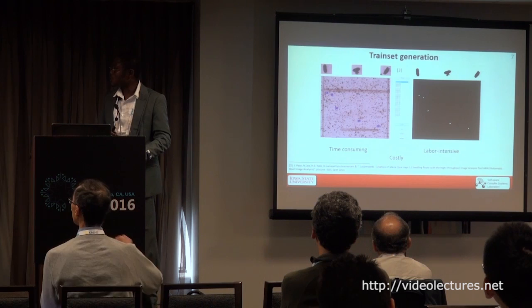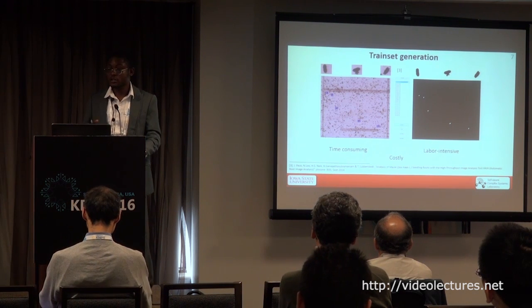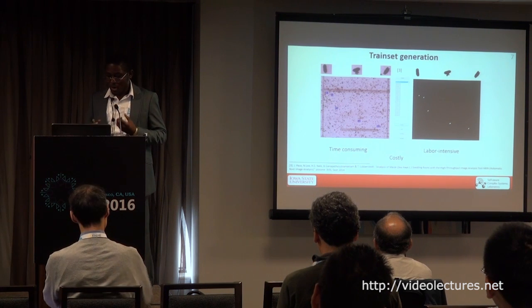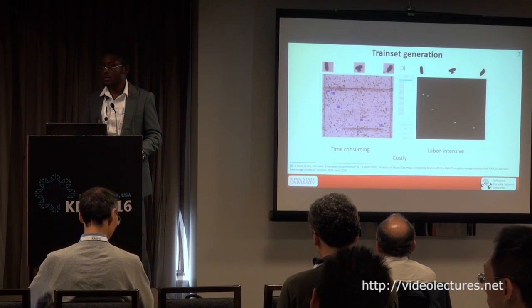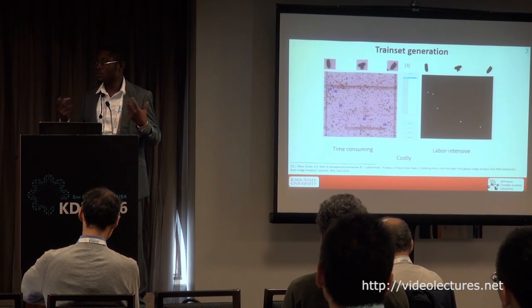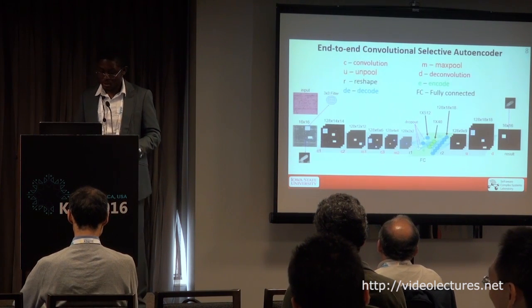On the other hand, some other engineers designed a semi-automated approach where they would do a background-foreground separation, and then use a click style to separate the foreground, which are the eggs, from the background, other debris and other things. However, that's still costly and inefficient, because they have to do the clicking and clicking. So we looked at that and said, can we get those images and the labels, which they already have, and train a deep network, which we know learns rich features, to do the task for us? We just run the algorithm, go to bed, and get the results the next day, hopefully.